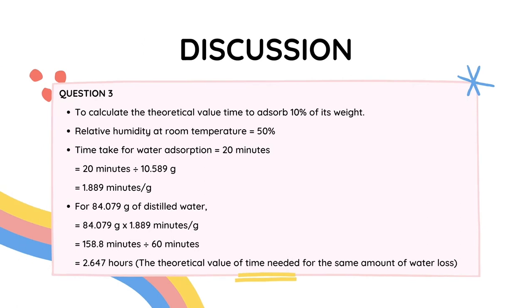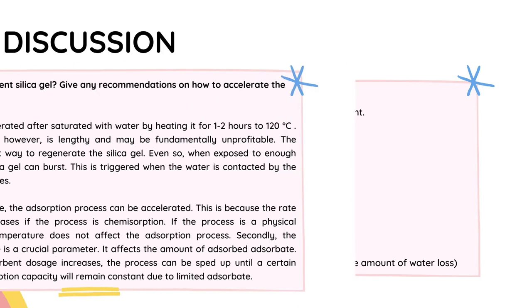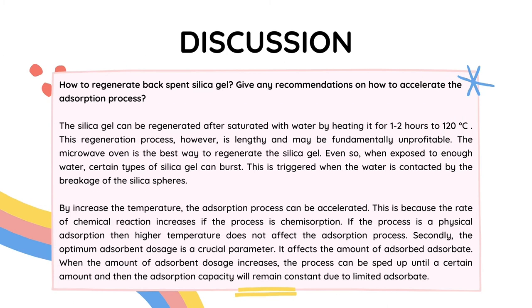For the last question, what is the theoretical value of time needed for the same amount of water loss you have encountered during the experiment? So for this question, the theoretical value of time needed for the same amount of water loss is 2.647 hours.